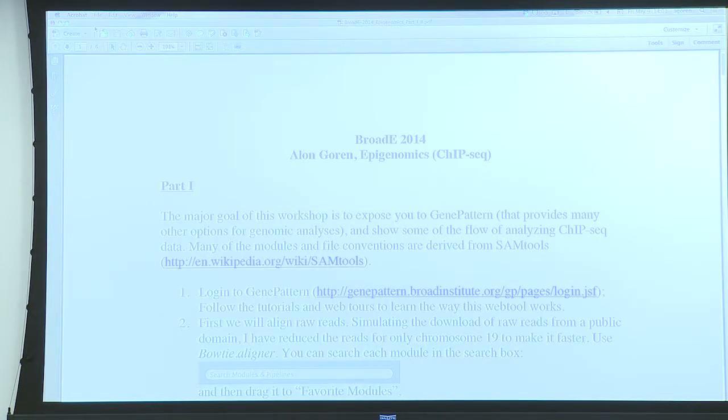And the idea is that it comes as a FASTQ file. FASTQ and all these names are things that you can Google and Wikipedia. And I tried to send you the link to SAMtools. But most of the machines are providing FASTQ files. And then you align them to a reference genome. And you get what is called a BAM file, which is the binary of SAM files. And again, this is part of the basic aligners.